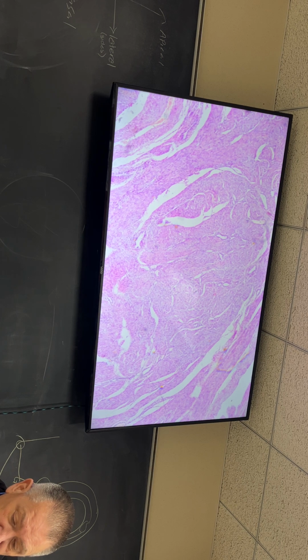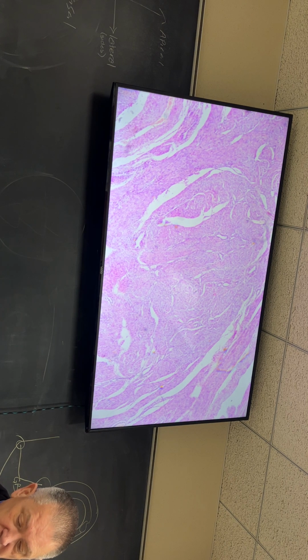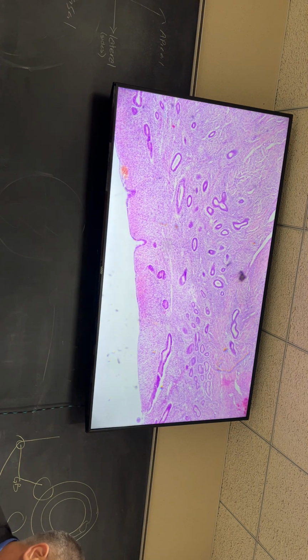Let me find a different side of yours. It's the same one. That's an ovary, okay. All right, let's try this one, see what this one looks like. See if this one shows me a better view of it. Here we are. It's kind of on a different edge, but there you go. Not bad, not a bad picture of it. There you go. All right.